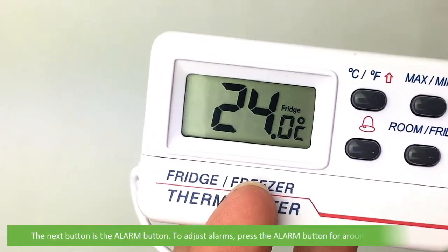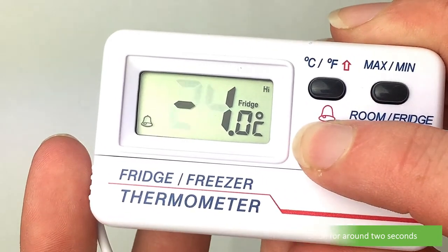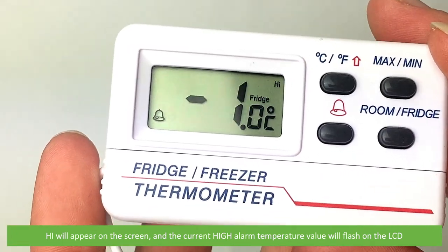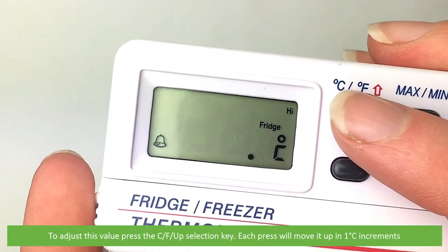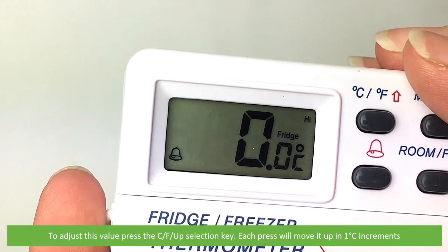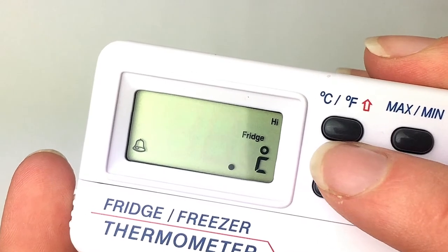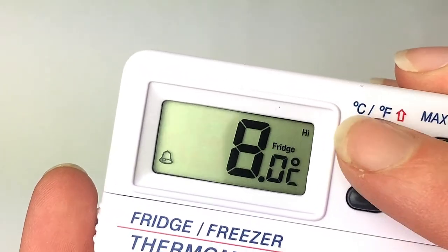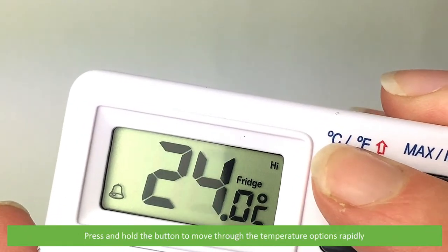The next button is the alarm button. To adjust alarms, press the alarm button for around two seconds. High will appear on the screen and the current high alarm temperature value will flash on the LCD. To adjust this value, press the Celsius/Fahrenheit up selection key. Each press will move in one degree Celsius increments. Press and hold the button to move through the temperature options rapidly.